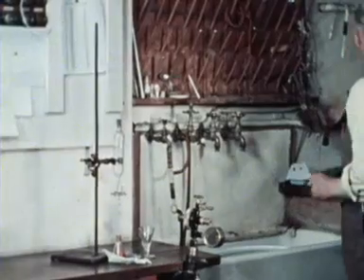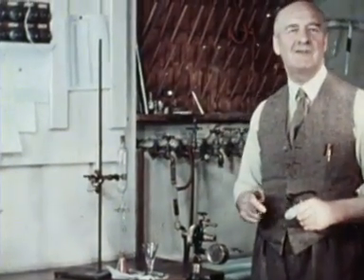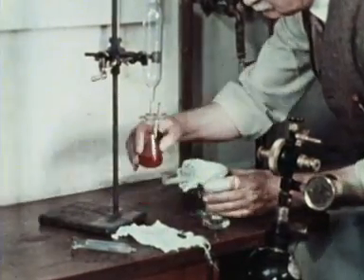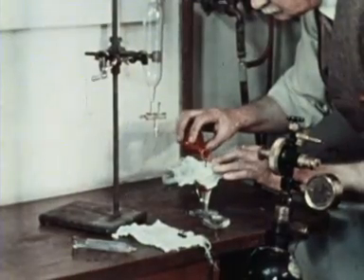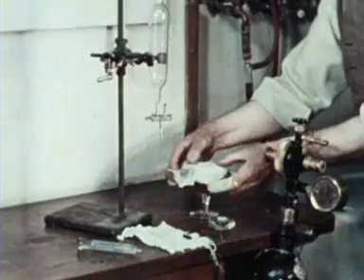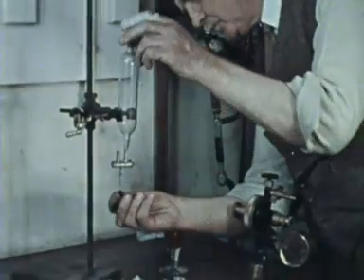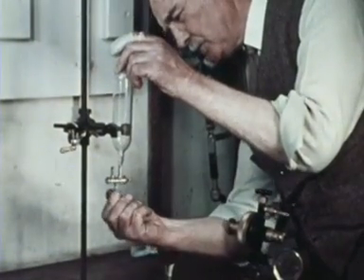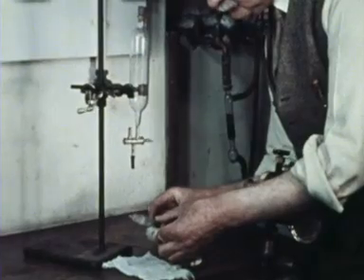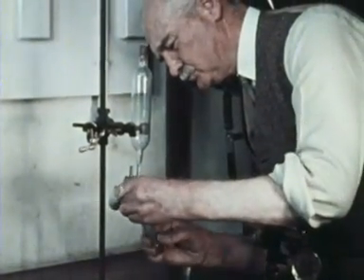Alternatively, it might be a solution of haemoglobin. We can't be sure. Either way, it makes little difference to the demonstration. To make the gas mixture required, he must introduce oxygen in the form of air into the tonometer. At the moment, he is only measuring the volume of air approximately. He will analyze it later.